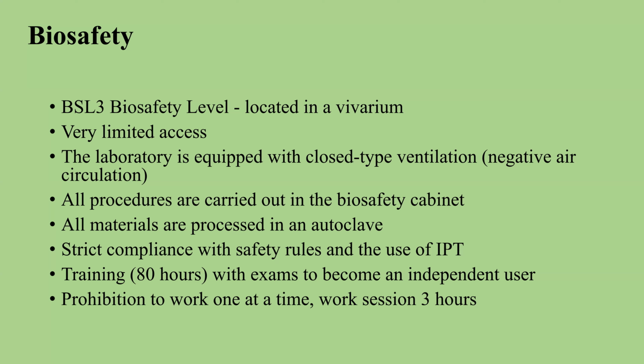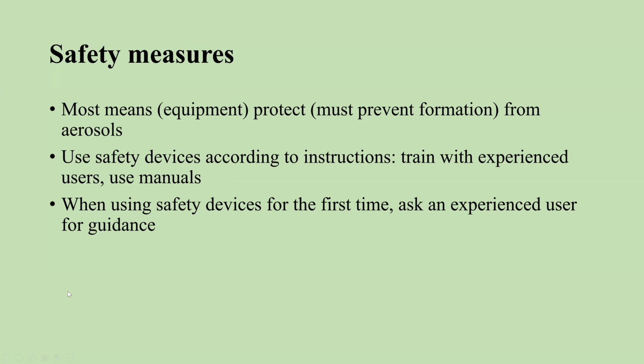This lab has a biosafety cabinet where all procedures are carried out, and personal protective equipment is of course used. The lab prohibits work sessions longer than 3 hours. Before you start working in this lab, you should take a training course of 80 hours.